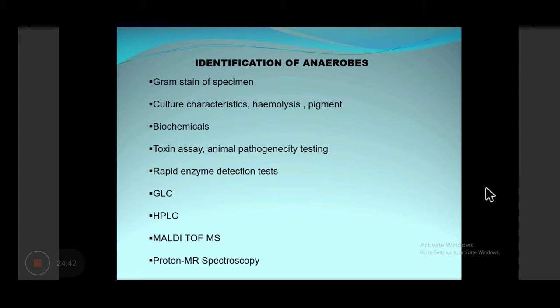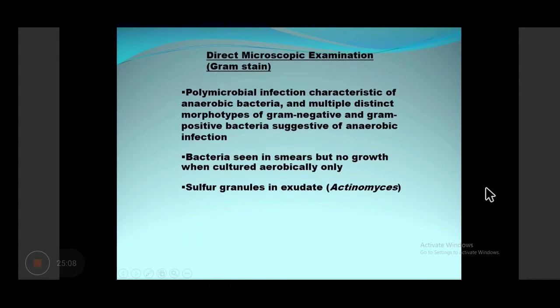These are the only anaerobic infection, so you should proceed later. These are the typical fusobacterial morphology. Fusiform bacilli. These are the shape of gram negative tapered bacilli. They can be pleomorphic, rounded end, or a bizarre shape, meaning not any confirmed shape.